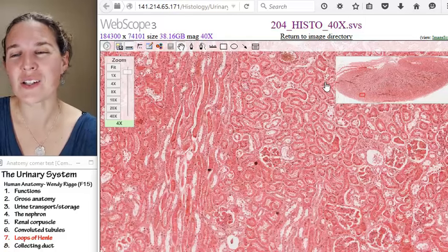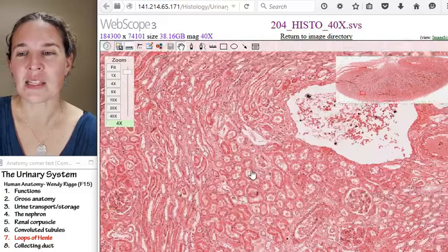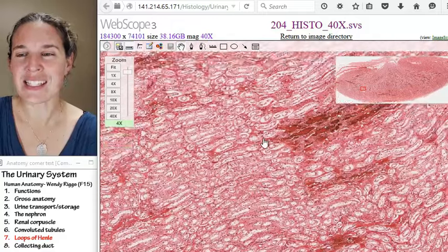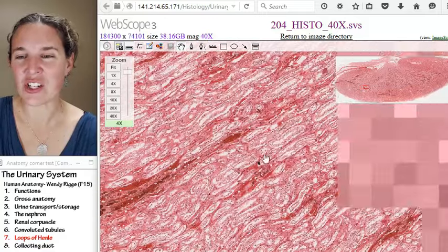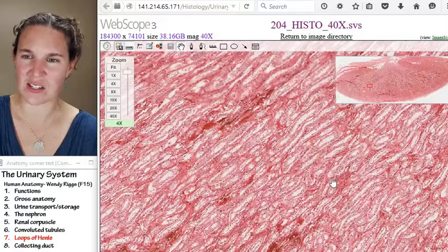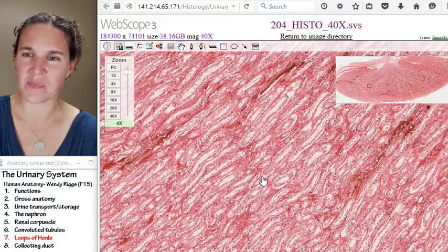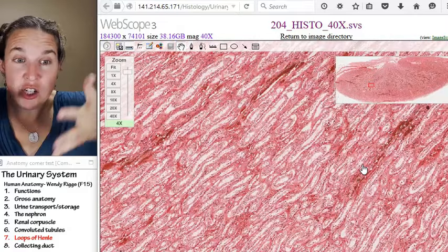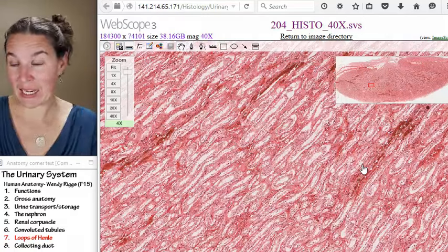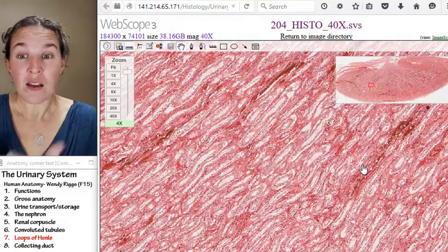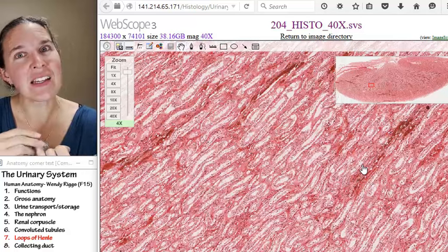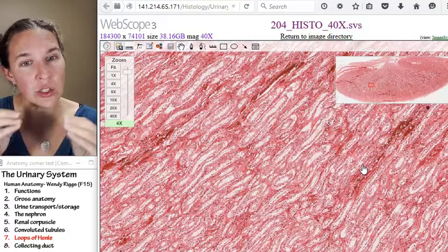But let's go check out the medulla. Let's go farther in, and you can see that the nature of the situation changes. Does it look different to you here? The medulla is just going to be a massive line of wholly collecting ducts and loops of Henle.